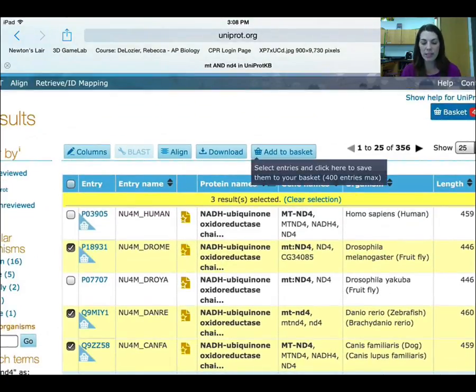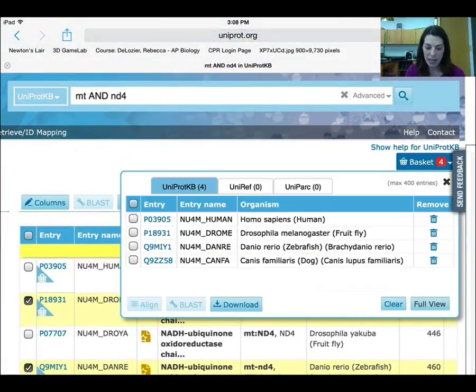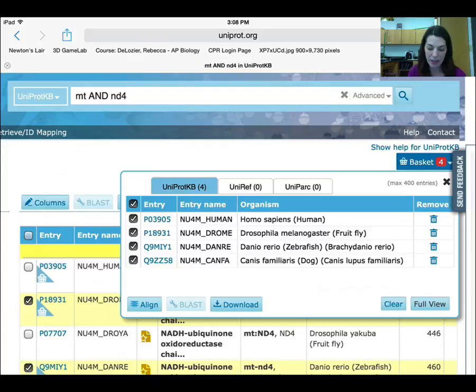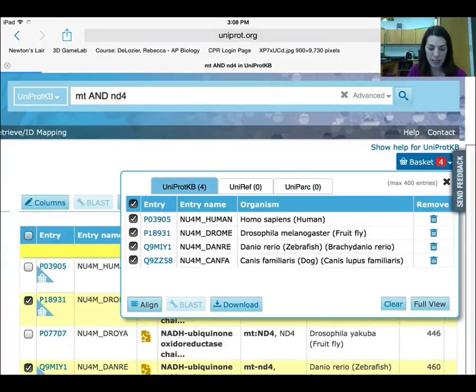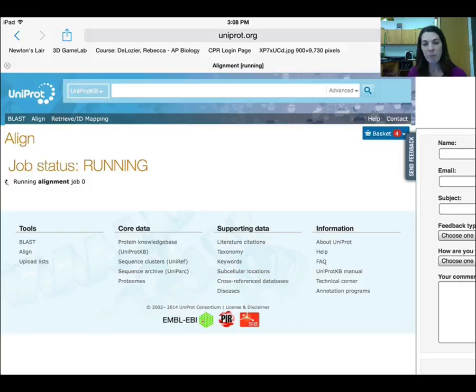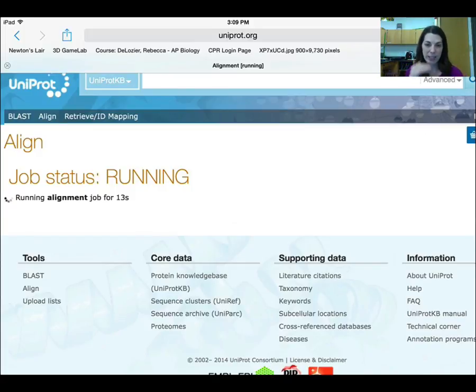Once you have all of your sequences selected, add all of those to the basket. Then go up to where it says basket, click the box above the check marks next to 'entry' — that selects everything. Then select where it says align. That's going to take the protein sequences — the amino acid sequences — for each of those organisms and line them up for comparison.